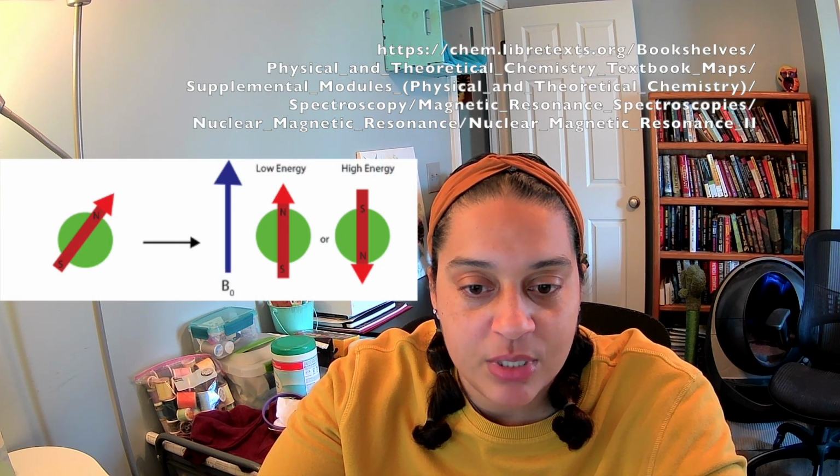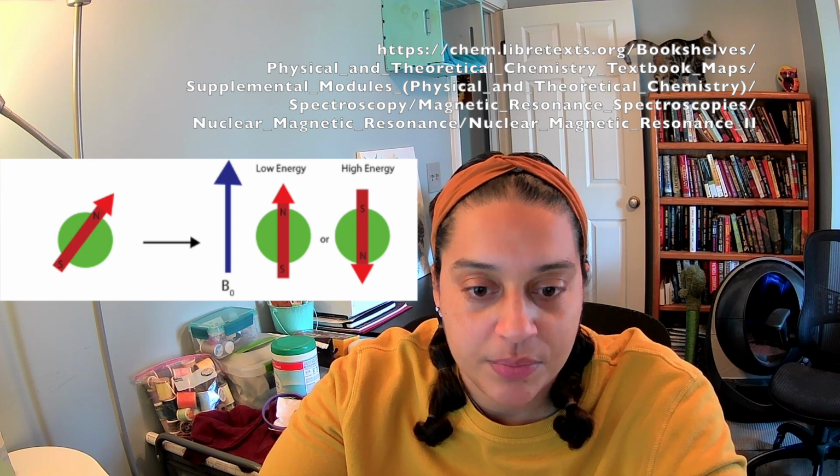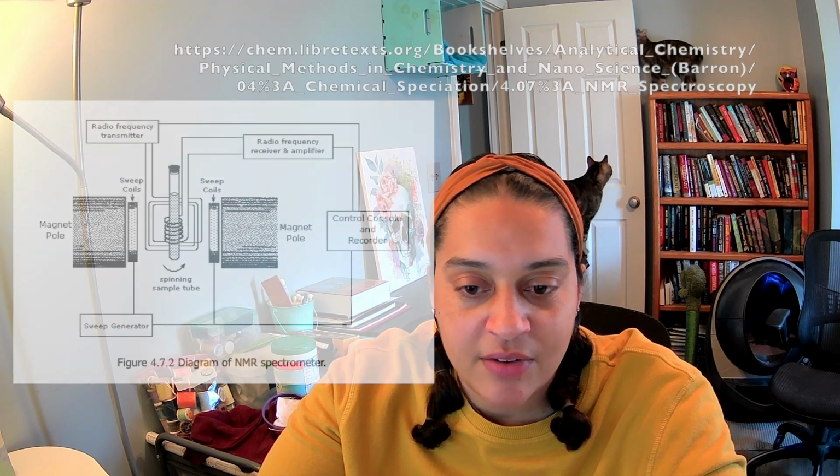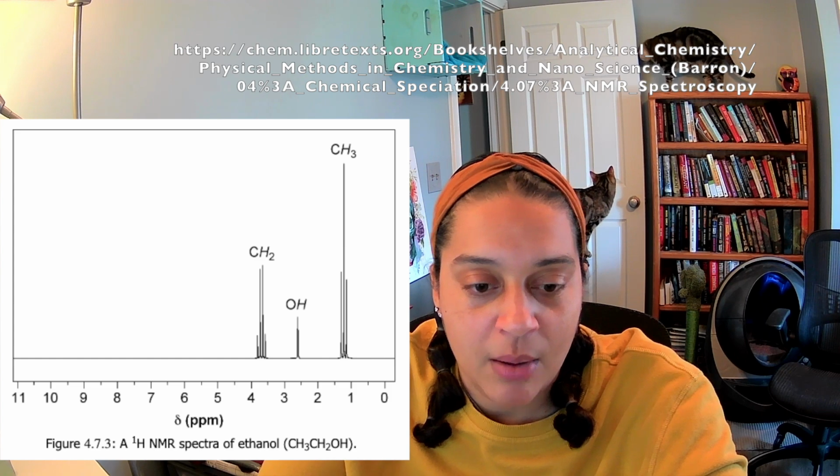In NMR, a sample is placed in a magnetic field which forces an alignment with or against the external field. Within that magnetic field, radio waves are used to promote transitions in energy levels, which, if we think about the bar magnet, it will spin the other direction. So north and south will be oriented opposite of how they previously were before the change in energy. A computer will compile the radio frequency information, the external magnetic field, the nuclei spin, and the magnetic moment produced, and a spectra that is unique to that compound will be produced.